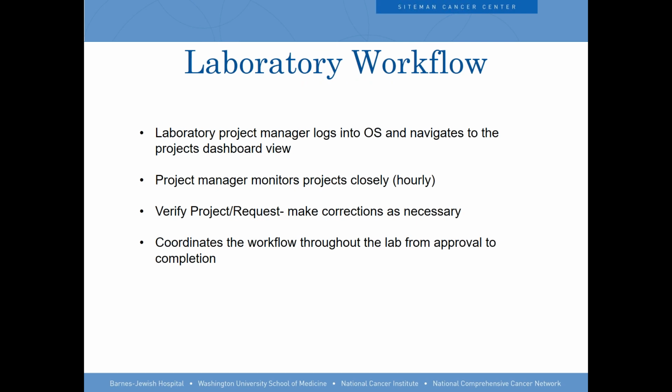Now the laboratory needs to do something. So what's their workflow like? Well, they have a dedicated, what they call laboratory project manager, that manages these different projects. So they make sure that the specimens are pulled if they're in the freezer and they're processed appropriately, and that's the person that actually goes in and updates the service so that the project request actually reflects the services that are done to those specimens.